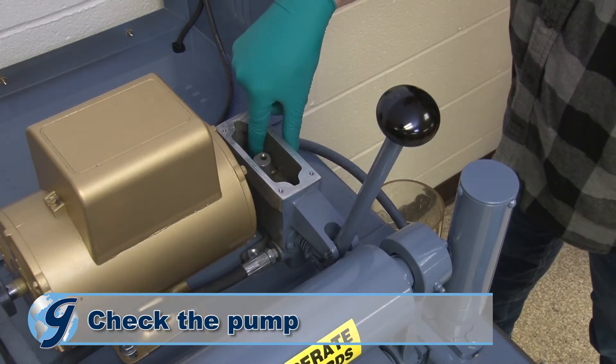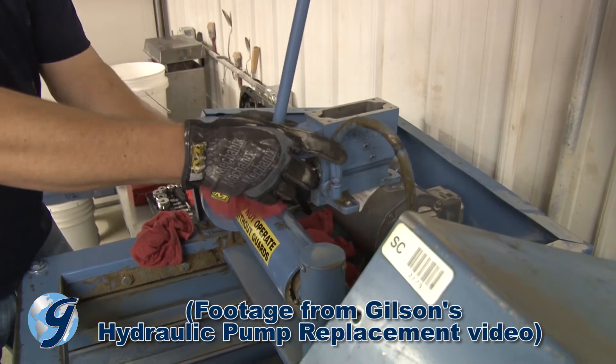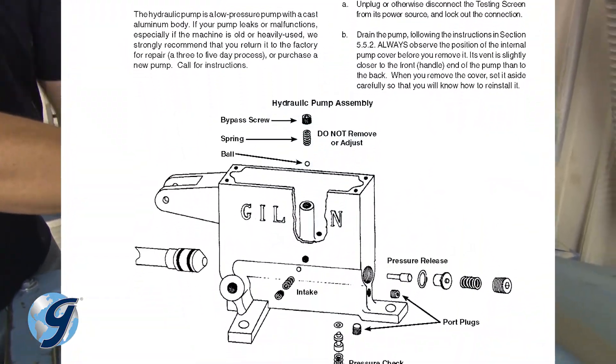If there is sludge in the bottom of the pump reservoir, remove the pump from the machine and clean it out with solvent as described in your operating manual's hydraulic pump section.